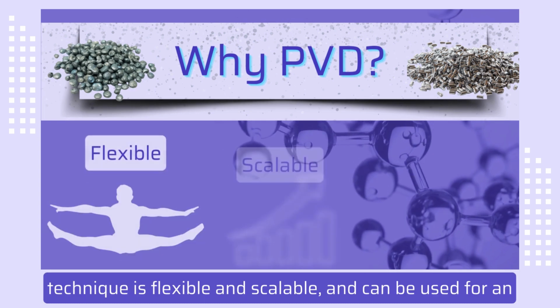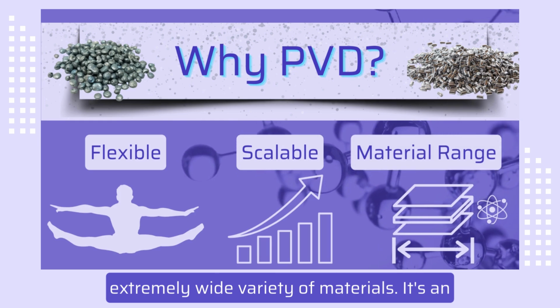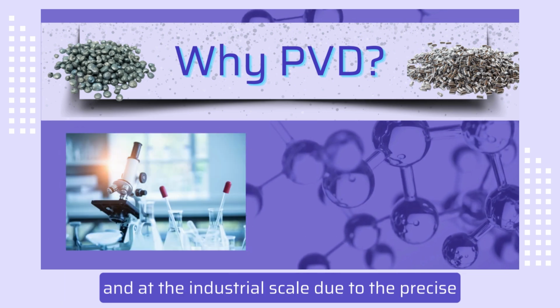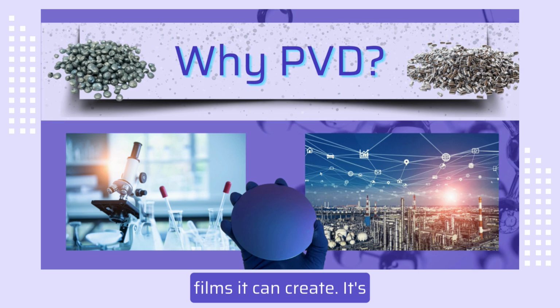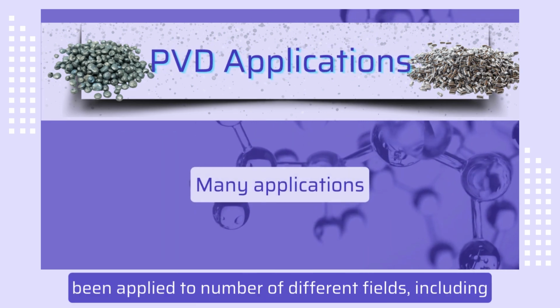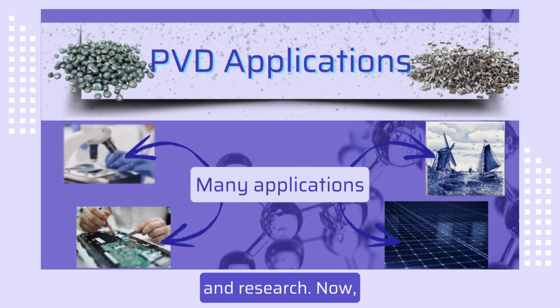The technique is flexible and scalable. It can be used for an extremely wide variety of materials. It's an advantageous method to use both in the research lab and at the industrial scale due to the precise films it can create. It's been applied to a number of different fields, including decoration, thin film fabrication, and research.